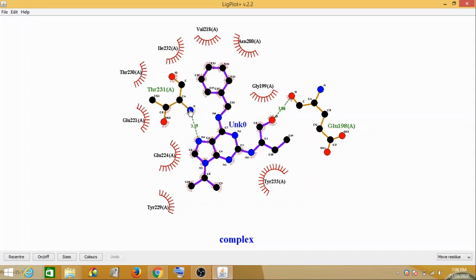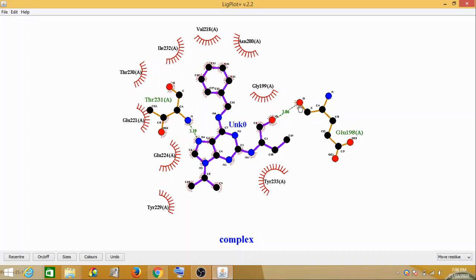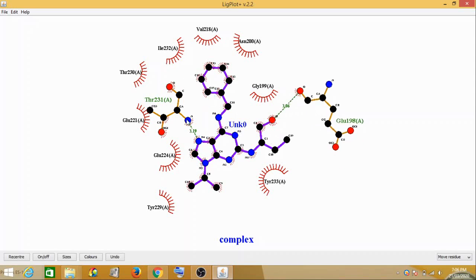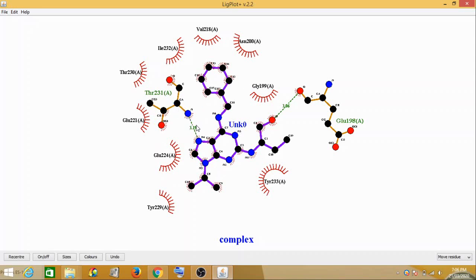The one which you see in purple titled as UNK is your ligand, and these two here, that is threonine 231 and glutamine 198, are your interacting residues.